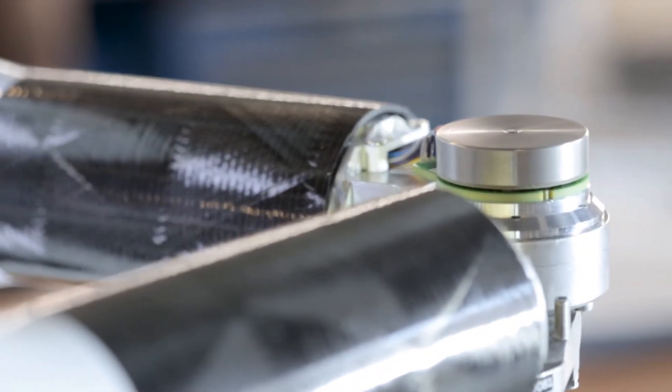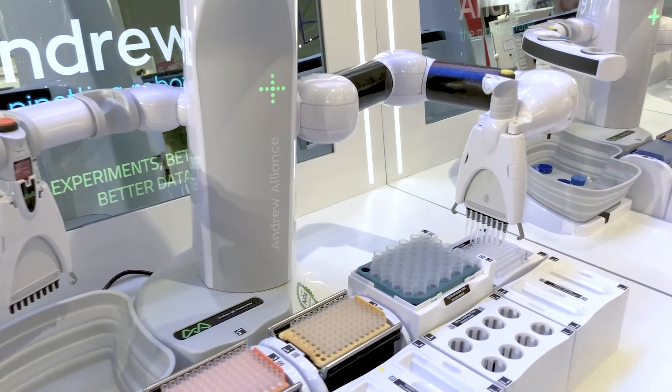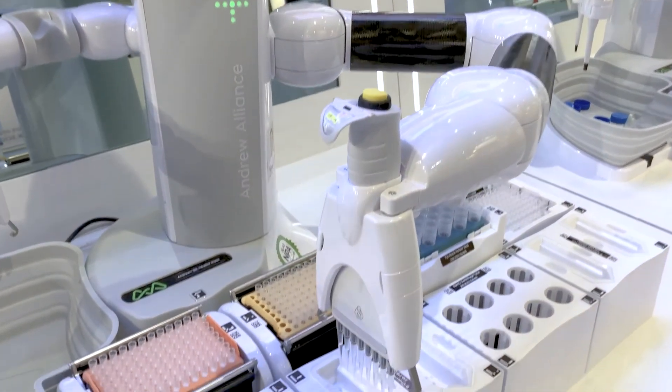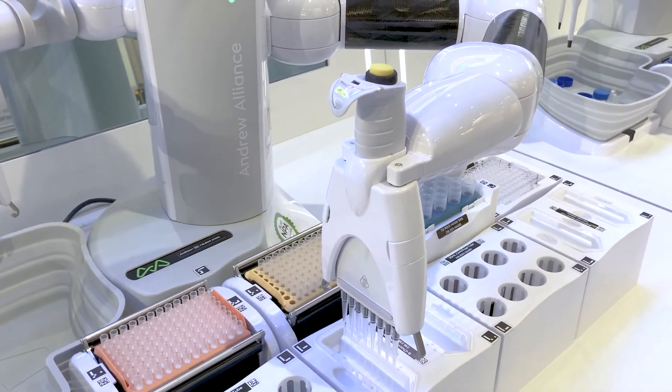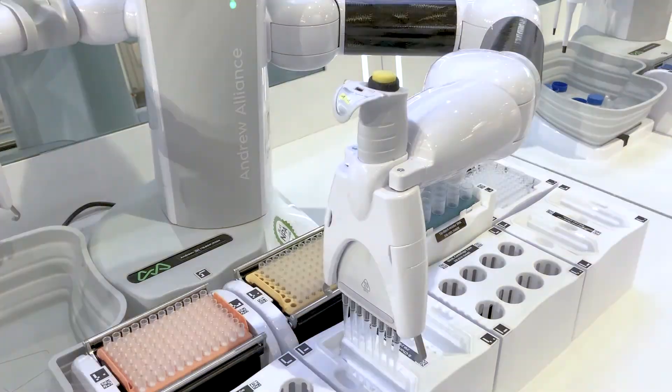There is also a hall sensor that allows us together with the end signal of the encoder and the magnetic absolute sensor of the output shaft to make a homing of the arm without touching any mechanical stuff. This is also a very interesting behavior that we could implement thanks to the Maxon motor.